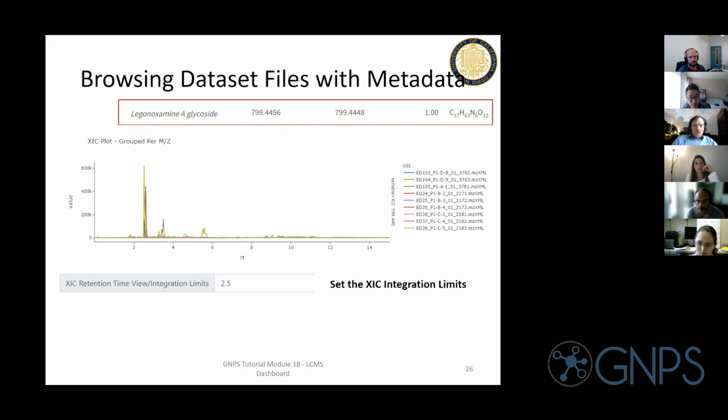If you want to be more precise, you can set a range yourself. We don't show the example here, but if you want 2.4 to 2.6, you can write exactly that, 2.4-2.6, and the system will understand what that means. A lot of times we don't need that precision because we're just playing around. But you can set those up yourself. So anyway, that's that there.